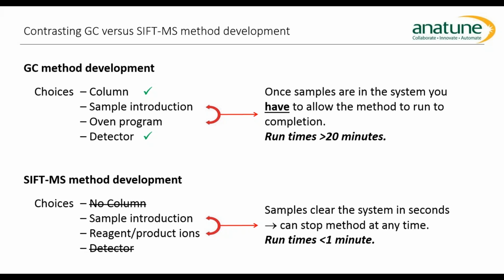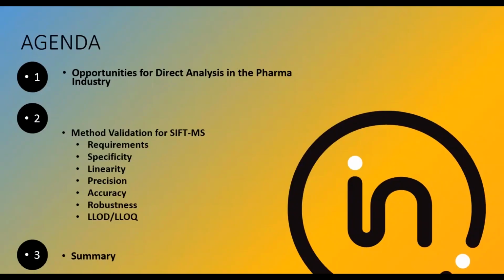So what I'm going to do with this webinar is we're going to look at two different validations. One's going to be sort of manually introduced gas phase analysis, looking at formaldehyde, and then we're going to follow that by a much more complex automated sample prep type method that looks for BTEX compounds in soils. So let's first have a look at the formaldehyde validation.